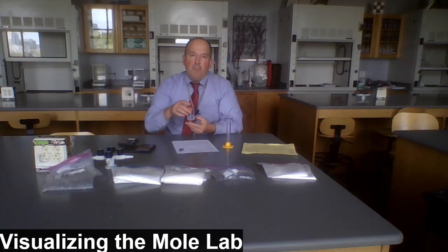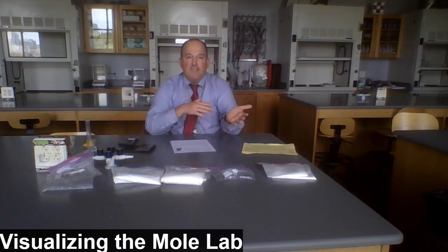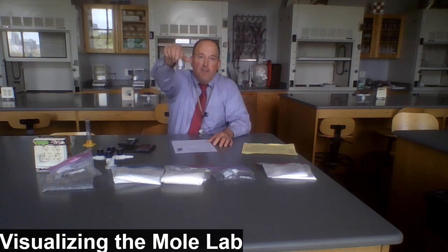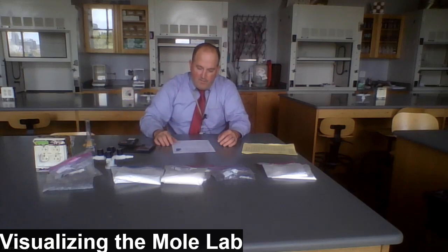The beautiful thing about the mole concept is that we can use such a huge number to let us translate something that's really, really small, like atoms and molecules, into something that's workable on a lab scale. I can work with this amount of water, but if you get much, much smaller than that, I'm going to either need specialized equipment or I won't be able to do this. I might be able to do something on micro scale, but it gets really hard to work with small amounts of substances. So station 1 is complete.